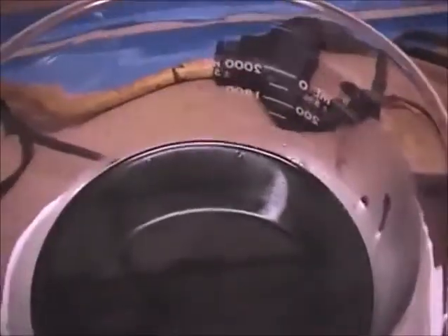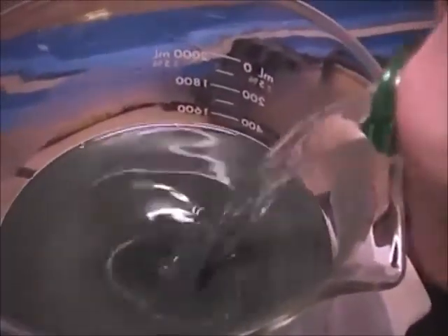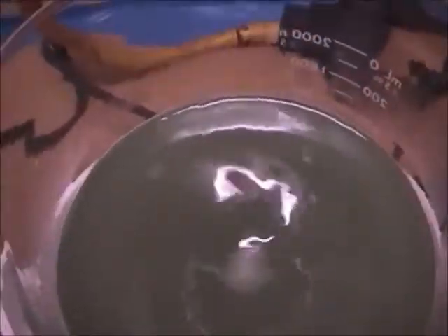As you can see, we've got some bubbles trying to form on top. Let's stir it a little bit to get the solution mixed up good. Sometimes it takes a minute for these chemical processes to start occurring. Add just a little more in here. And voila, you can see the silver starting to precipitate out. That's what that is, the swirls of real fine silver powder in the solution. Stir a little more, and let the solution slow down. Looking at it from the side, I could see a real fine powder starting to form on the bottom.